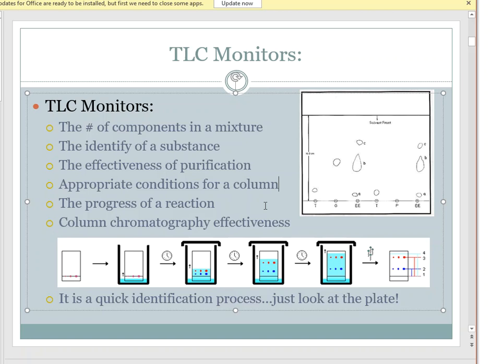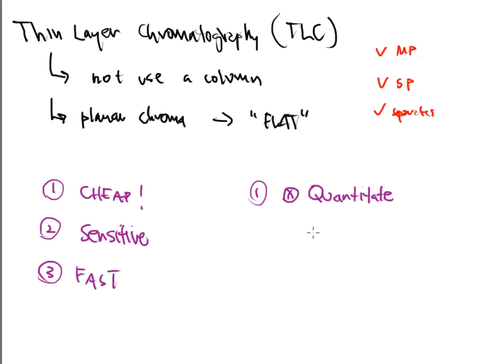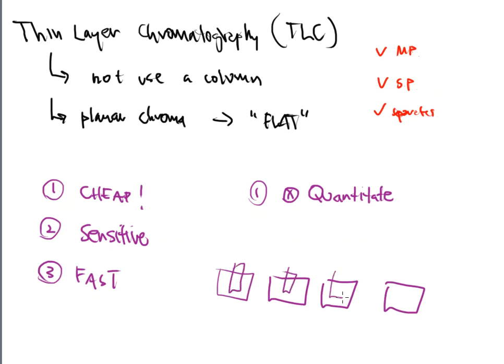In a laboratory I can set up a series of beakers side by side and put a TLC plate into each one. They can all be different: plate number 1, 2, 3 and 4 have different stationary phases on them. I can then put my mobile phase in, allow the TLC plate to develop, and start to see my spots.